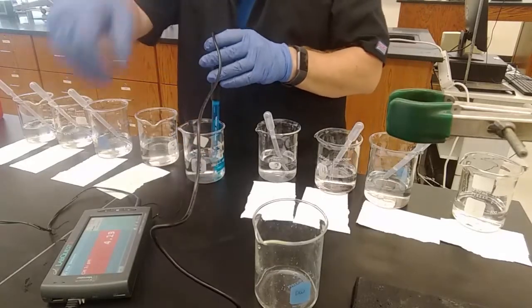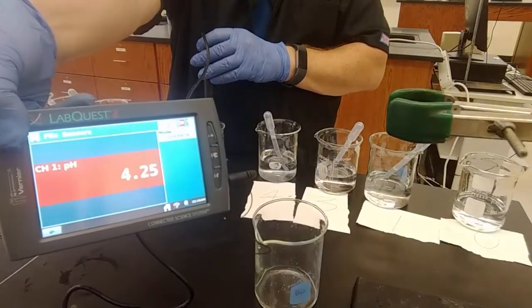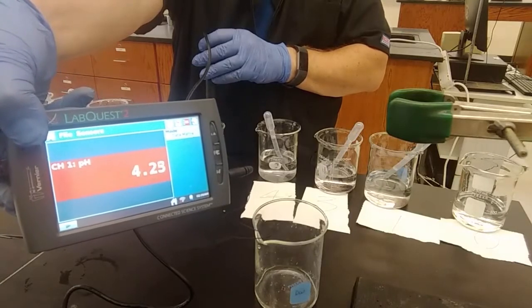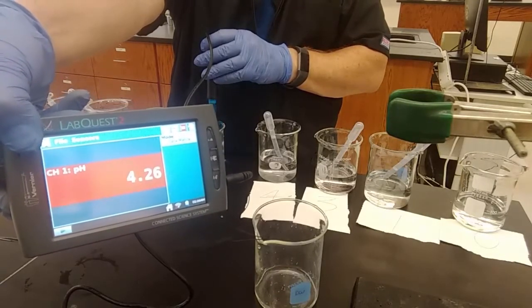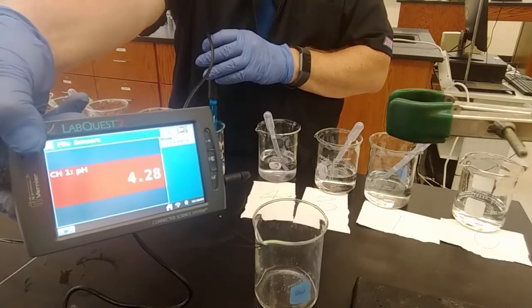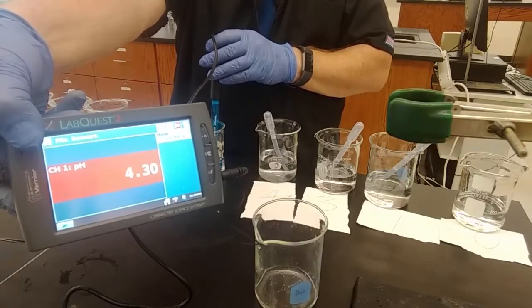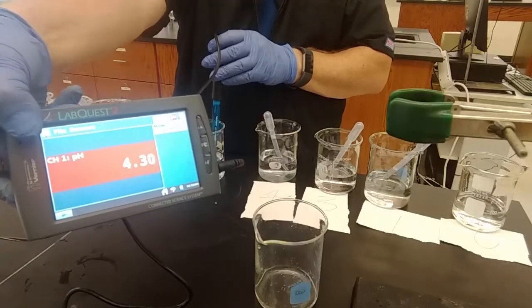Okay? So, interestingly, our pH 7 water appears to be pH 4.25 according to the pH meter. Either the meter is wrong, or the water is rather acidic, which is entirely possible, I suppose, but that's pretty low.